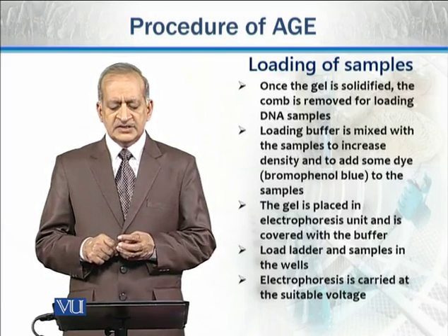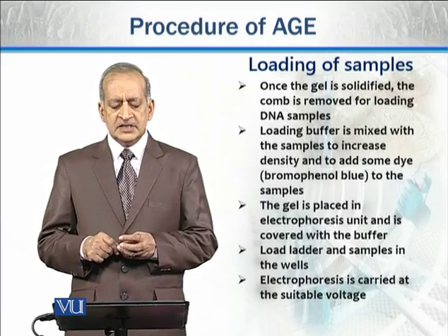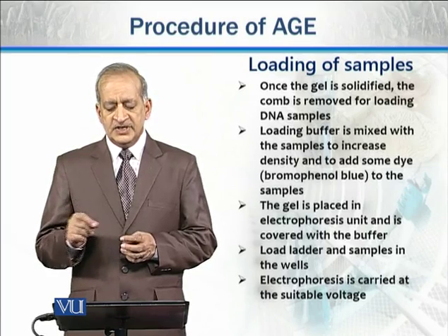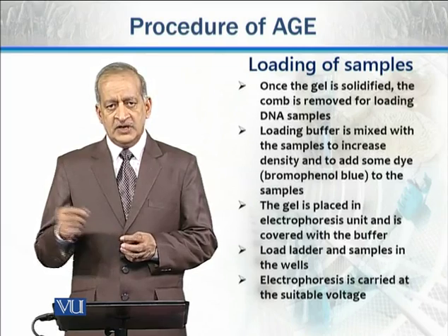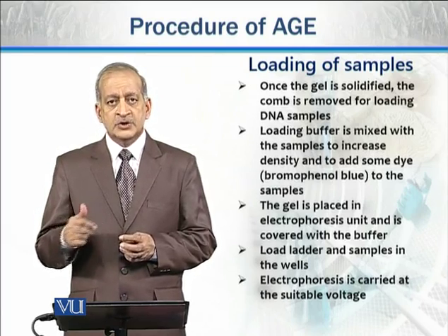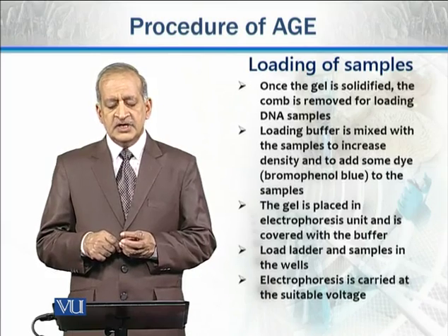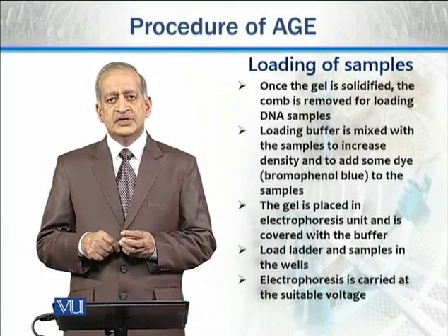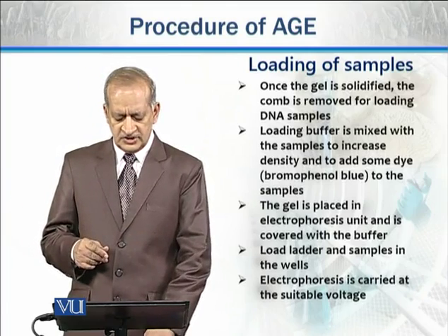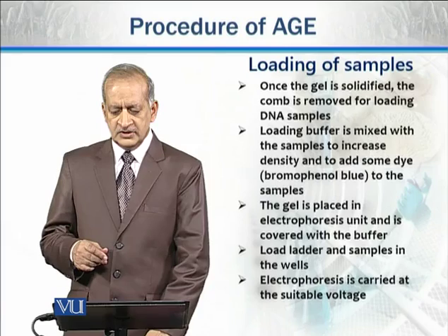The gel is placed in the electrophoresis unit and is covered with the buffer. And similarly, samples are loaded in the wells, as we have discussed earlier on, with the help of micropipettes, and electrophoresis is carried out at the suitable voltage. It can be slightly faster, it can be slightly slower, depending on the need of the procedure.